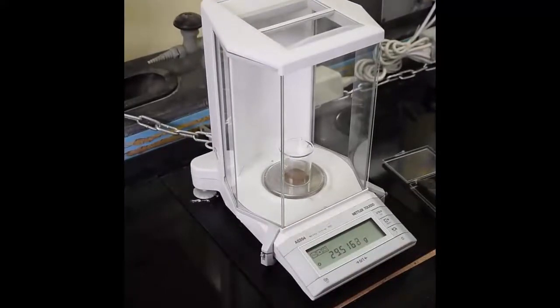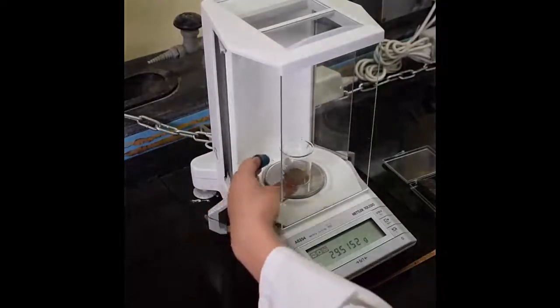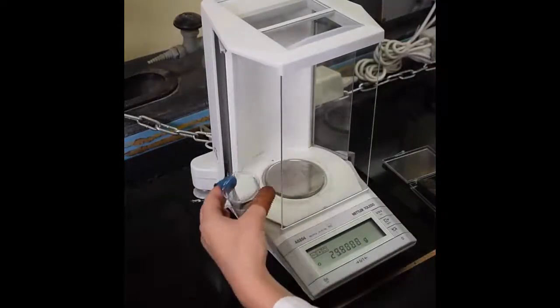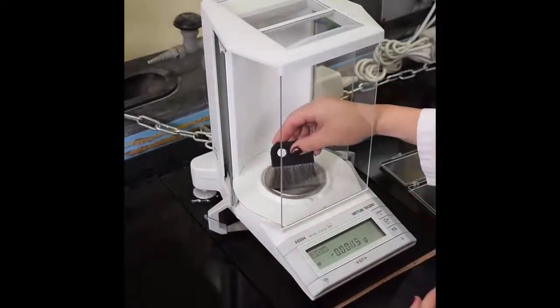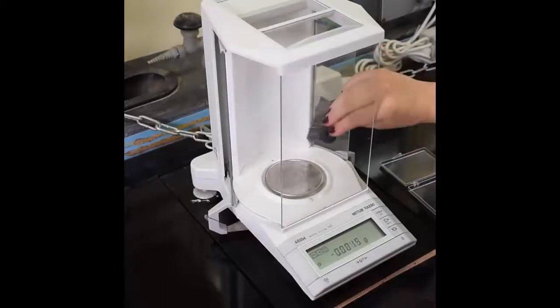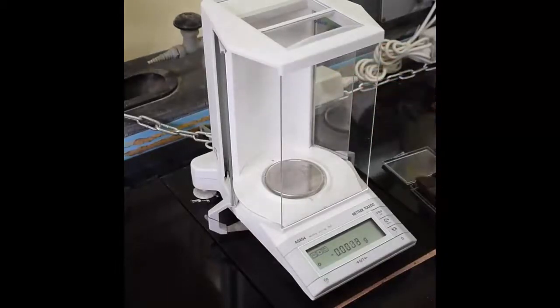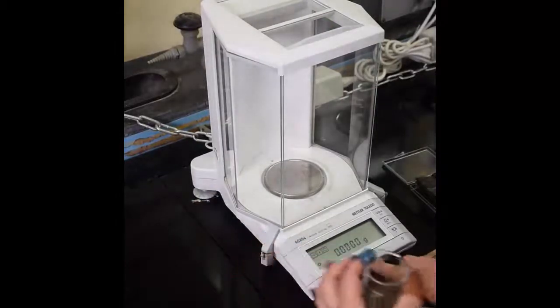Static charges can be dissipated by patting the inside of the balance compartment as well as the object being weighed with an anti-static brush. Make sure to re-zero before continuing to weigh.